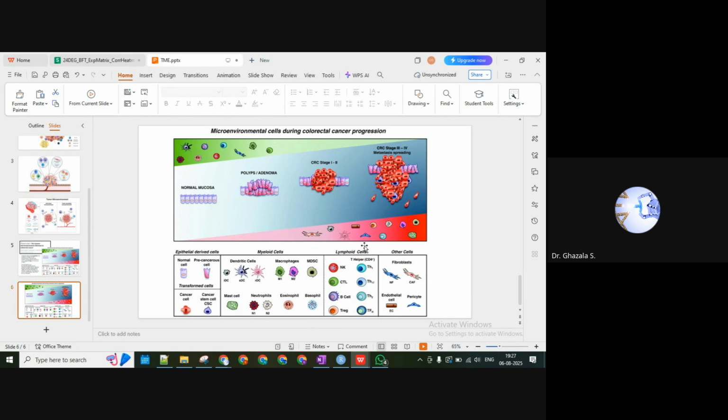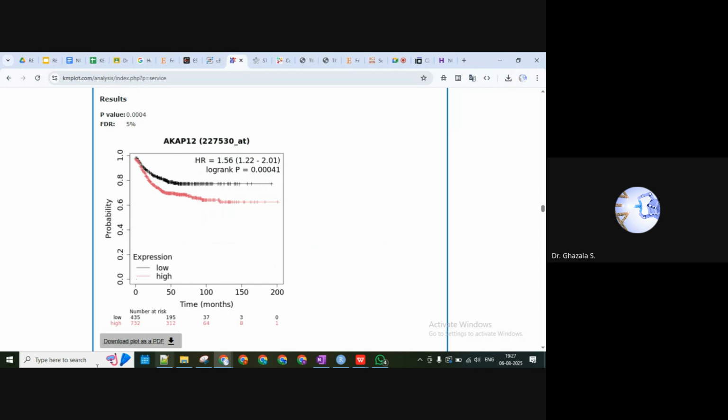Even if your data set is not from progression, and it is still in stage 1 or maybe stage 2 cancer, right? That's why we are doing this study. So in that case, we need to first understand the function of each type of cell, and accordingly we will filter which cells are involved in promoting the cancer. Then we can understand how they are helping or promoting the colorectal cancer.